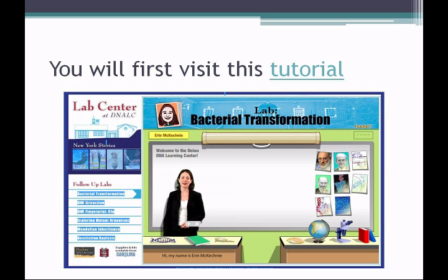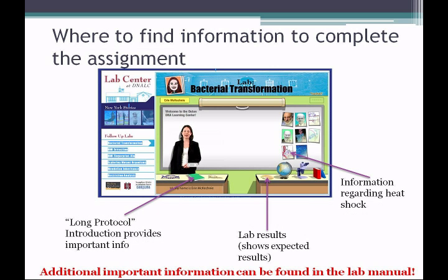Before you start this assignment, I suggest that you go to this tutorial. You'll find a link to it right in the Blackboard site, and this describes the lab that you'll be performing on bacterial transformation. Where you can find information to complete the assignment will be here in this bacterial transformation lab in a few different places.